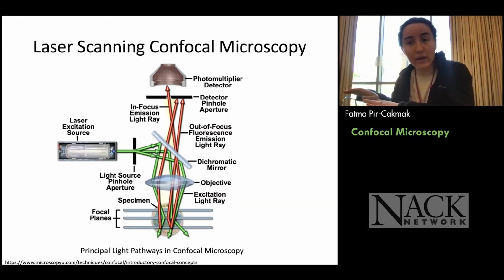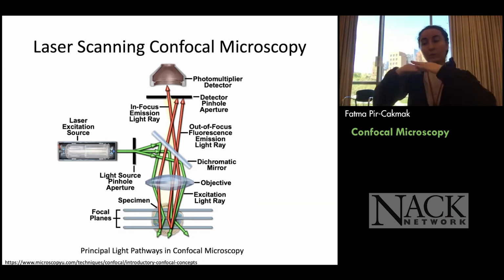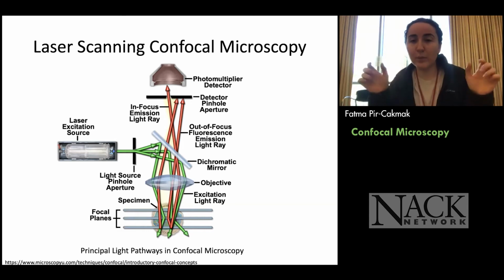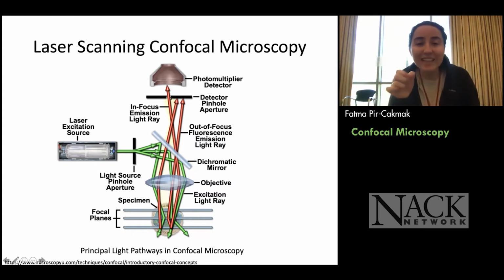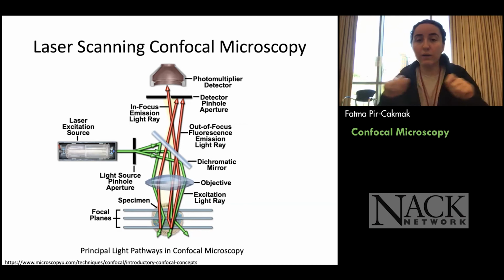It's still there. You're not doing anything to your sample, but you're just collecting a certain region, and it lets you slice up your sample and observe that part of it. It's quite nice. I think it's a quite simple method. You just have a hole, and you can adjust it. If you want a smaller thickness, you can use a smaller pinhole, and if you want a bigger one, you can open it.